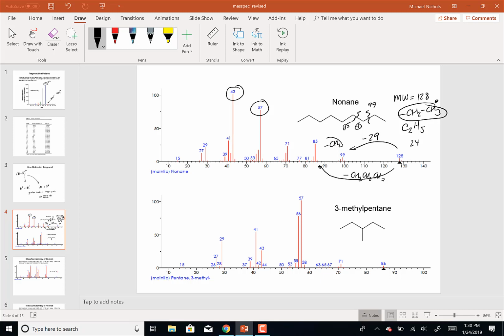And sometimes we put a lot of stock into those. Those are sometimes called, I think, the parent fragments, or the parent ions, the ones that are the biggest. If I'm doing computer matching and I have 2 spectra and the parent ions, the largest ones, aren't at the same mass, I immediately say that's not matched. And I would even be tedious enough that if I'm looking by hand at matching, if 43 is supposed to be higher than 57, and the spectrum of the structure I'm trying to match it with has it opposite, it's not a match.